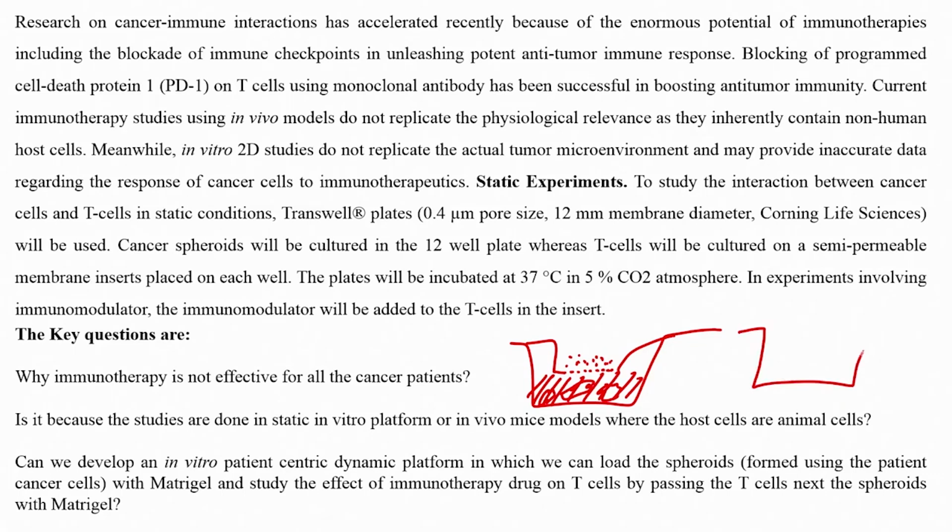You have another well, you load T cells, you have spheroids, here again have T cells, right. Wait for 24 hours and see CD4 CD8 ratio, right. Here wait for 24 hours, see CD4 CD8 ratio.